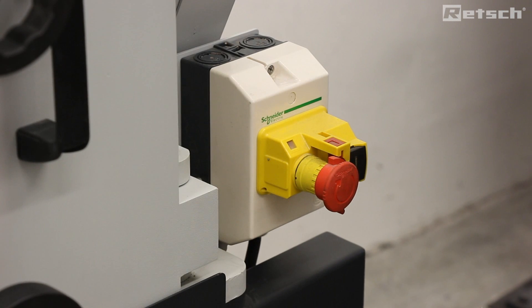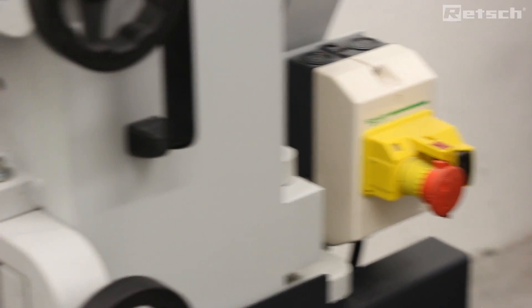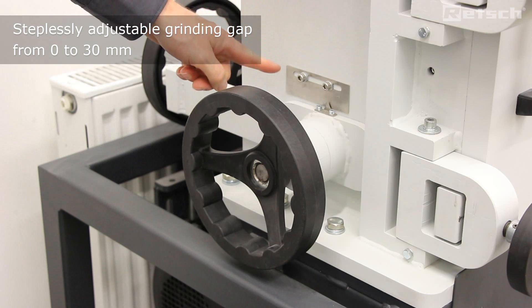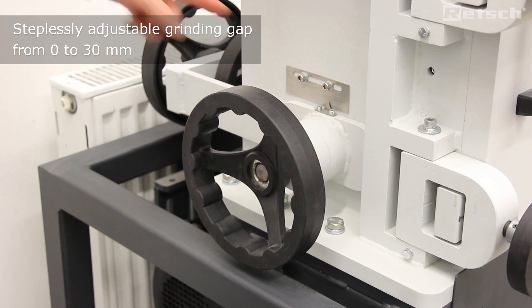Operation of the instrument couldn't be easier — we simply depress the start button. Importantly, the gap between the fixed and moving jaws is steplessly adjustable. This can be done using the scale from the range of 0 to 30 mm.